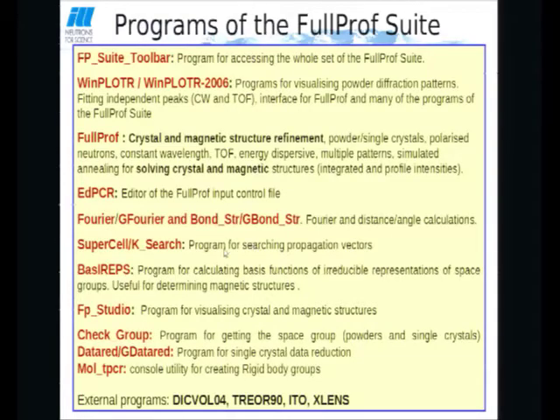You have also utilities to do supercells or look for modulation vectors and propagation vectors within the toolbar. And maybe I will go through that if we have time later on.